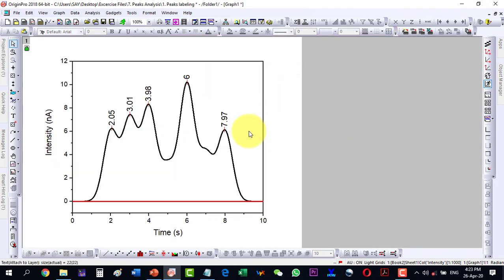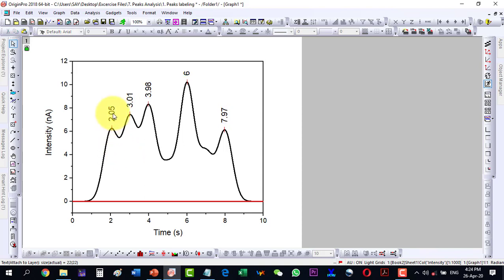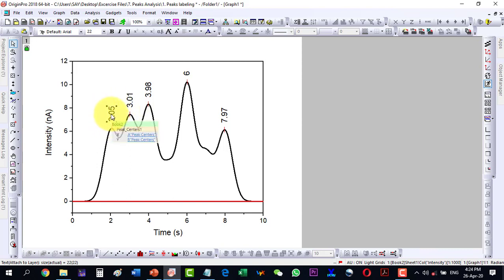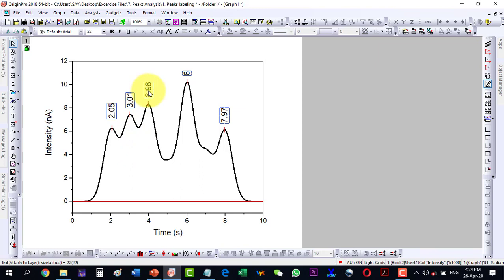If I want to edit these peaks, for example raise the height of one, clicking once selects all of them and they all move together. To select only one peak, click it once and then click it again after a while — it will show dots around it and that one can be individually moved up or down.